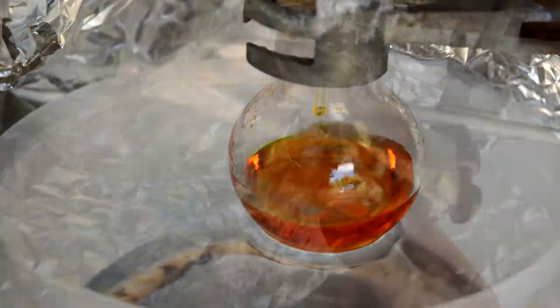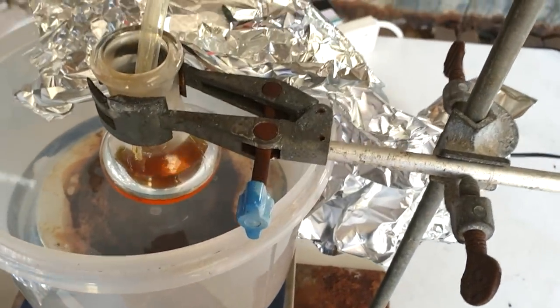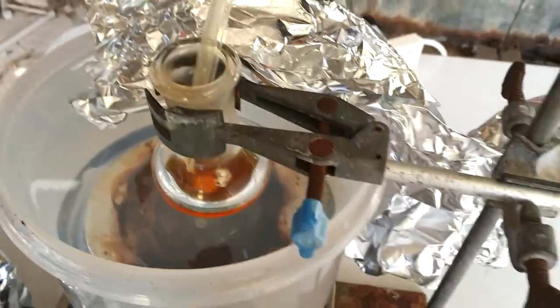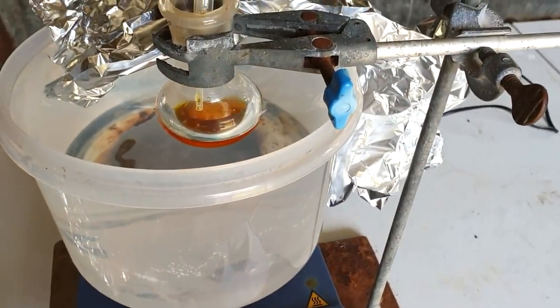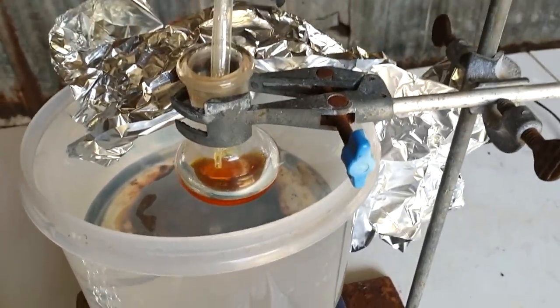Alright, this has been sitting at, the water's 50 degrees or so. So it's been sitting here for about half an hour. So all the DCM has been removed. I was hoping to remove a little bit of the dioxane. It's somewhat volatile. Got the air flowing in and it's warmed up, so should be able to remove volatile stuff. But there's still quite a bit of liquid left. So hopefully it's our product.